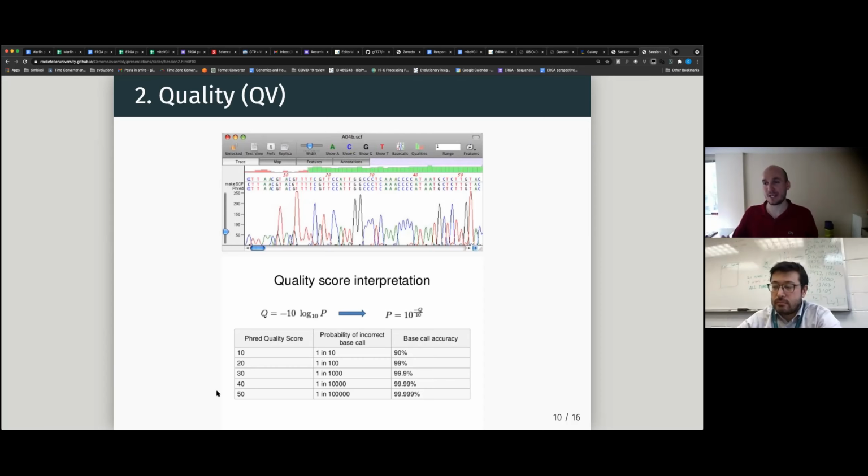So when you annotate the genes, your annotation is of good quality. So that's the reason why. But it's also not really easy to measure this number accurately. It's still there, but the point is that we are applying this principle developed for Sanger sequencing also to evaluate the consensus accuracy of the assembly itself.